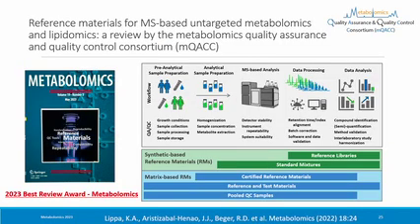So I would like to invite you to check out this review article. It was recently awarded the 2023 Best Review Award for the Metabolomics Journal. This was put out by the Reference and Test Material Working Group of mQACC. And basically, it's a catalog of the reference materials that are available for the community.